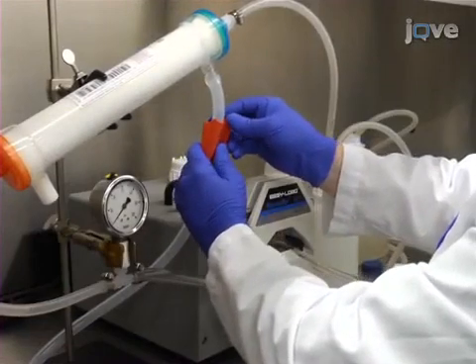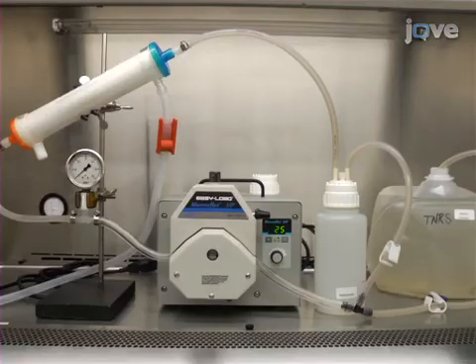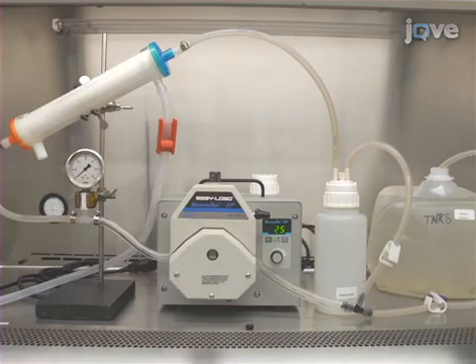Start by assembling the ultrafiltration apparatus inside a biosafety cabinet. Once assembled, the apparatus functions as follows.